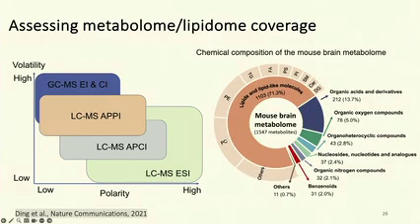However, if we use unpretreated samples, there is also a question of the molecular composition of those samples. And that's the example of mouse brain metabolome composition. About 70% of species are lipids. Lipids are usually at higher densities, and even if the technique is capable of ionizing polar compounds, the chances are high that your spectra will be dominated by lipids anyway, so just take that into account.